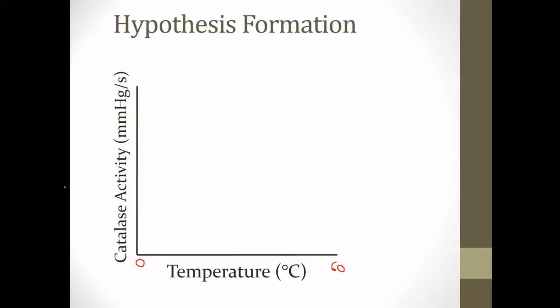So you'll want to think about, how will temperature affect the rate of the reaction? Remember, molecules are in motion, and different temperatures will affect those molecules in different ways. And some temperatures may even affect the shape of the enzyme. We may denature that enzyme just like we denatured the enzymes or the proteins in the membranes of beets in our first few experiments.